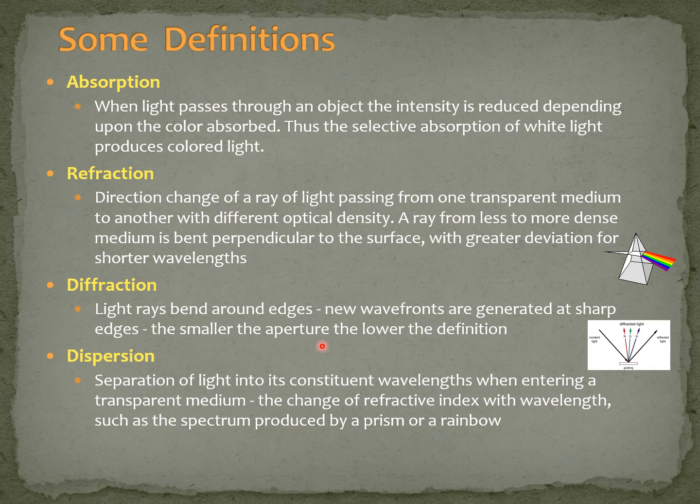On the other hand, I also mentioned to you that there's a limit to what we can resolve, to what we can see just by using direct light in our sample. So I'm referring obviously to Abbe's law that I talked about a bit before.